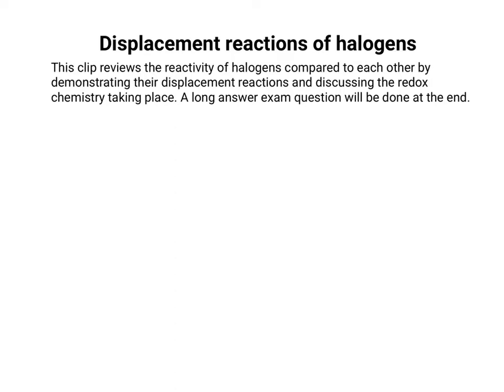Hello and welcome to this video that's reviewing the displacement reactions of halogens. Quite often when you do this in the laboratory, the nuance and the observations of what you see are sometimes lost. So I thought I'd do a little clip with some actual video footage of when I did it myself, and then talk about what's happening as it goes.